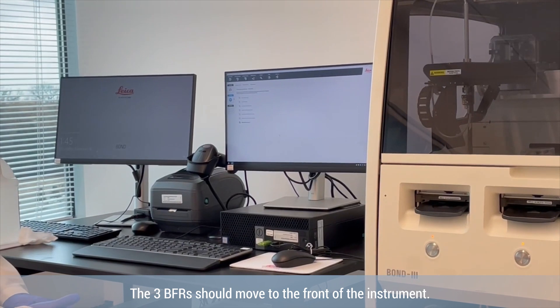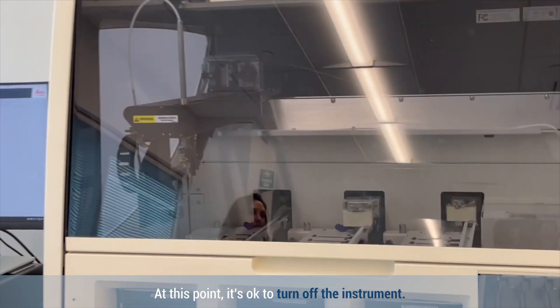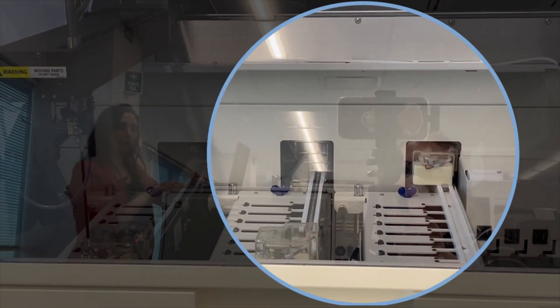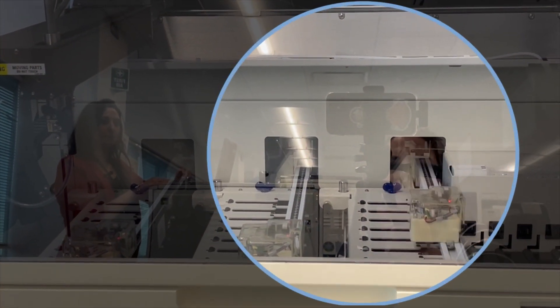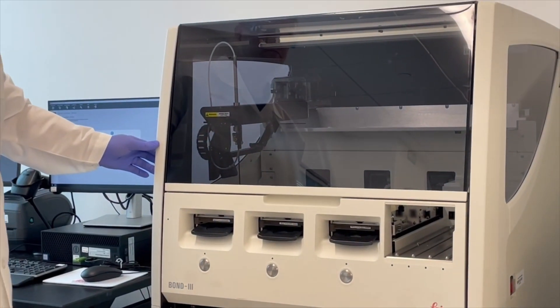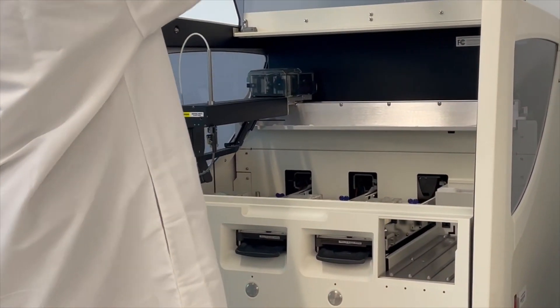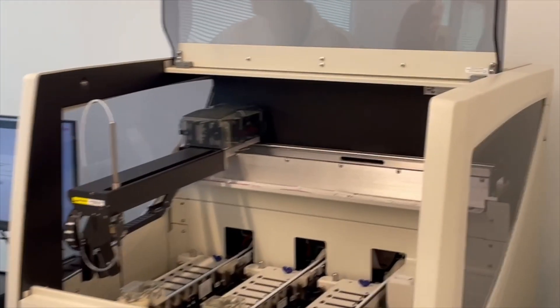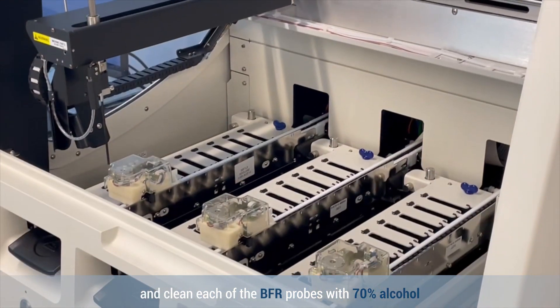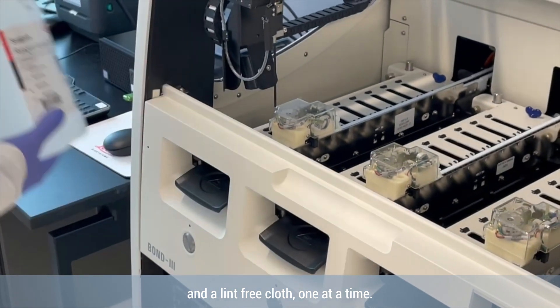The three BFRs should move to the front of the instrument. At this point, it's okay to turn off the instrument. Lift the lid from the center and clean each of the BFR probes with 70% alcohol and a lint-free cloth, one at a time.